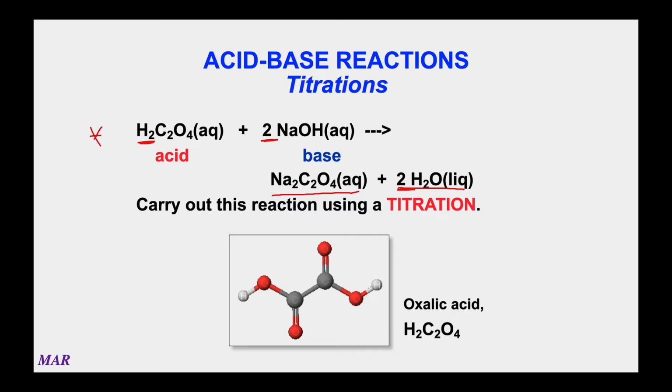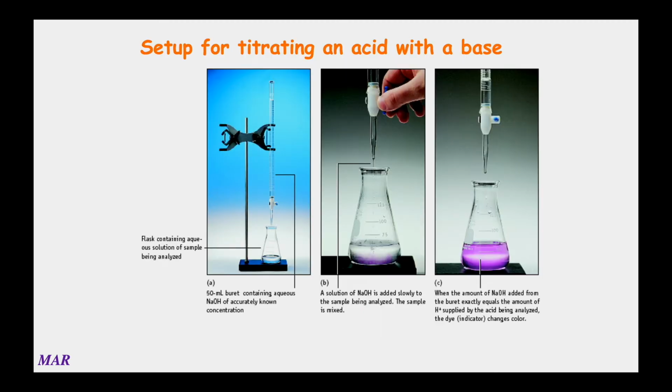If this class that you're in right now is meeting face-to-face, we will probably have a titration lab because it's a really cool technique. If this is a virtual class, then we'll show some examples of what titrations are like because they're kind of cool. This is an example of really how a titration works.